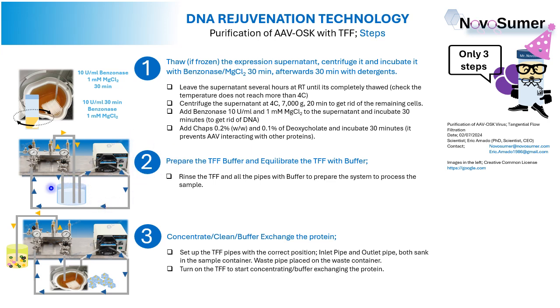As you see here, we will put here the buffer, and the buffer will go to the pump to the TFF, from the TFF to the recipient of the buffer. Okay, and the open circuit, you see here, will also be connected to the buffer recipient.